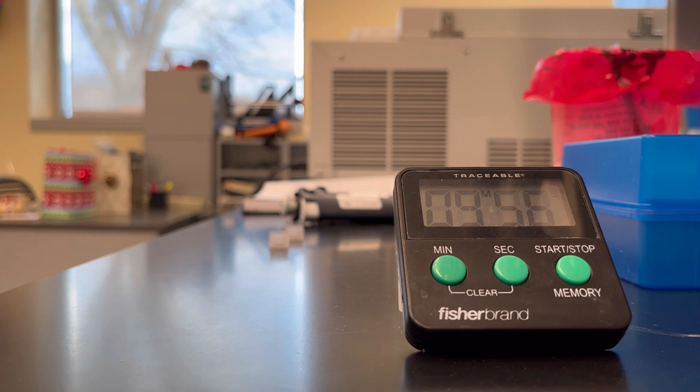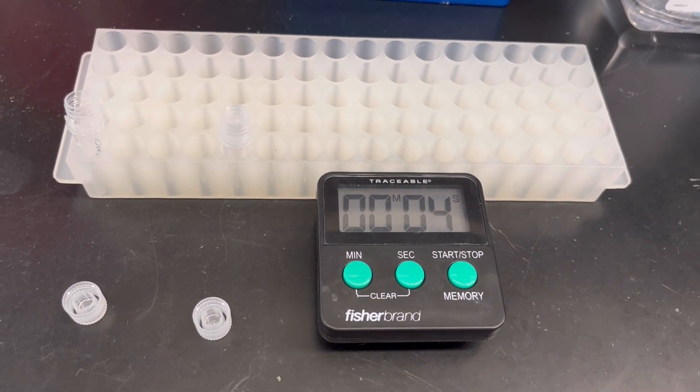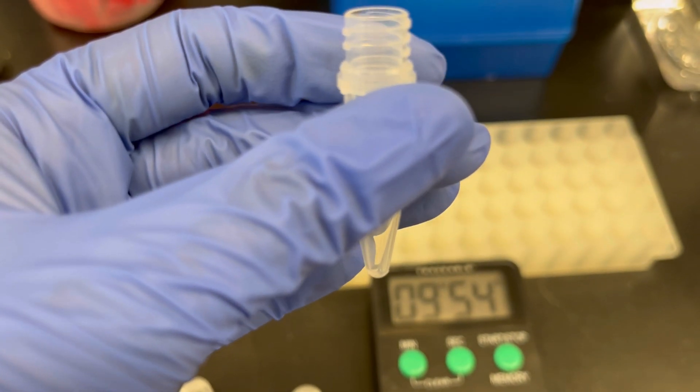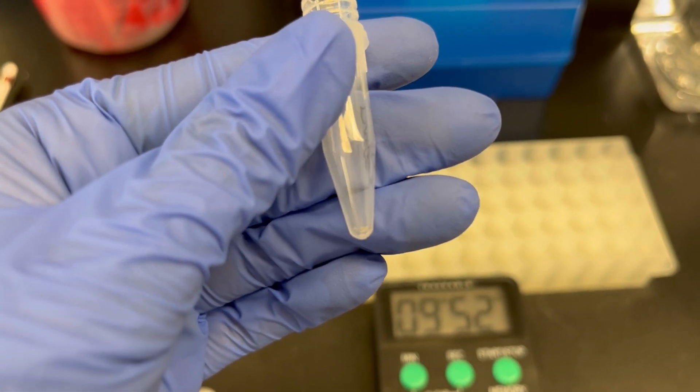Put the tubes down on the bench for 10 minutes with the cap open to dry out. As you can see, there is no ethanol left in the tube.